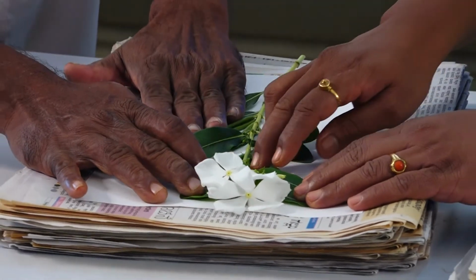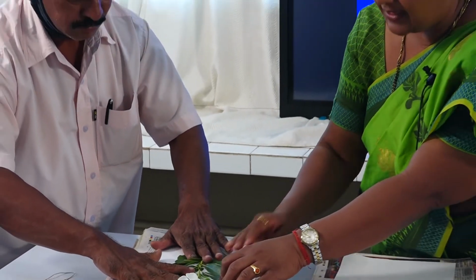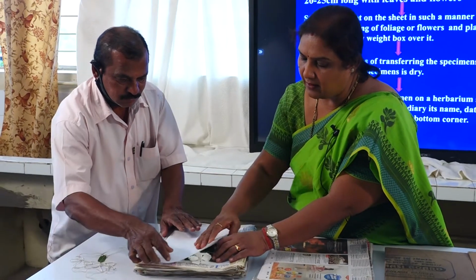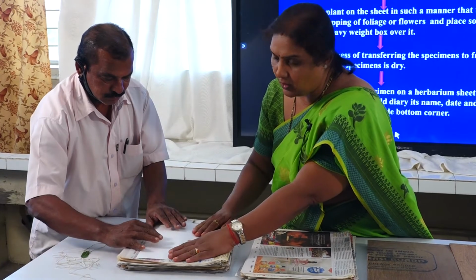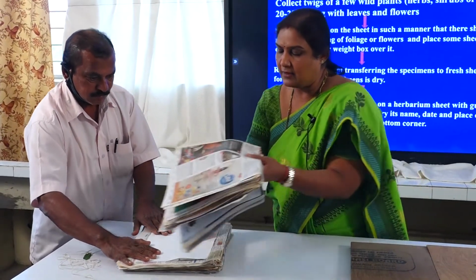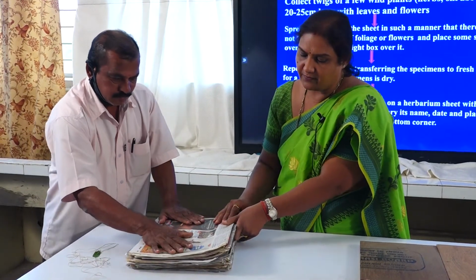It should not get wrinkled. Neatly it should be spread out. Then place one more blotting paper over this. It should not get crushed. Place one more blotting paper over this. And above this you place another pile of newspapers.